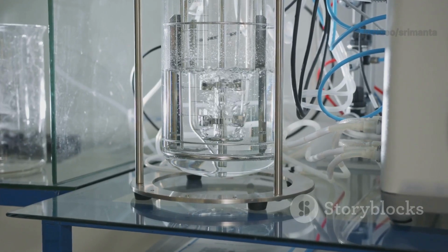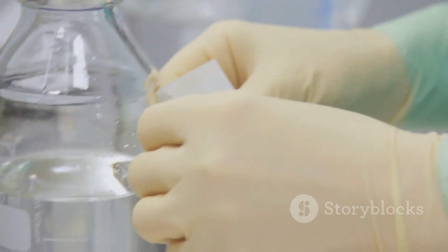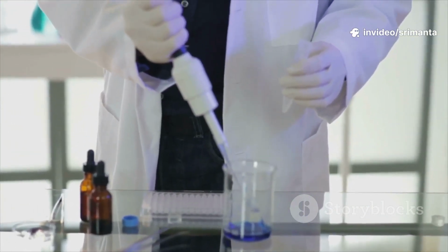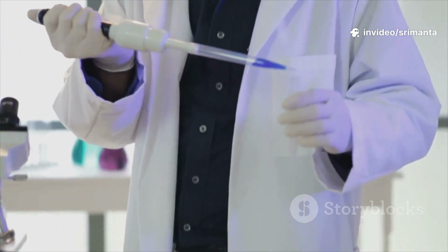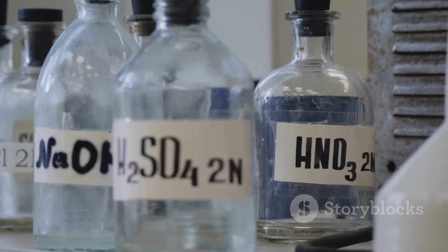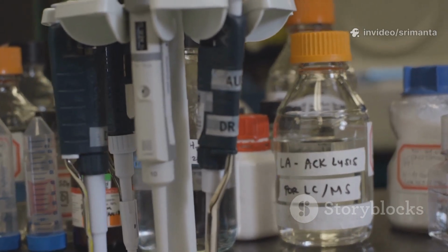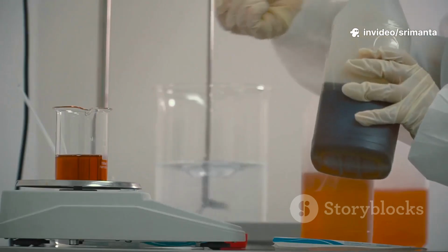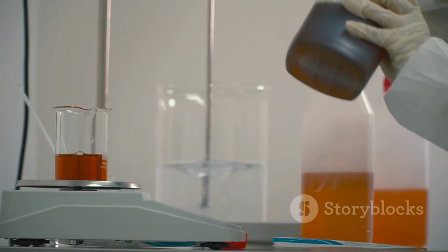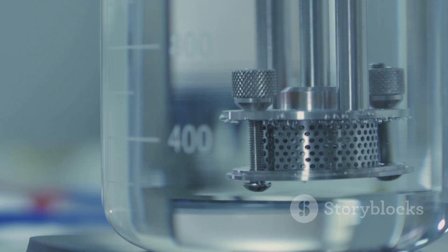Simultaneously, in a second identical Gutzeit apparatus, we prepare the standard solution. This is our benchmark, our control. Instead of our sample, we add a very small, precisely measured amount of a standard arsenic solution. This solution contains a known quantity of arsenic that corresponds to the official safe limit. For example, if the limit is 1 part per million, our standard solution will be made to match that concentration. We add all the same chemicals, potassium iodide, stannous chloride, and zinc, to this bottle as well. This setup will produce a stain that represents the maximum allowable amount of arsenic.